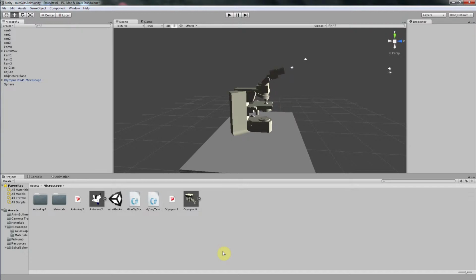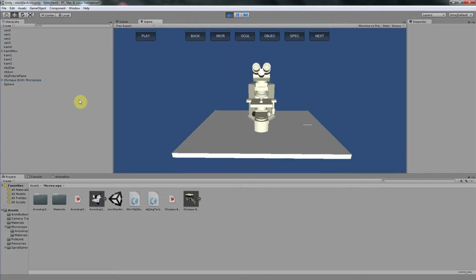We shall now see how to bring an objective glass to the microscope and how to then display quasi-video recording on the ocular. Let us look at first at the finished product.